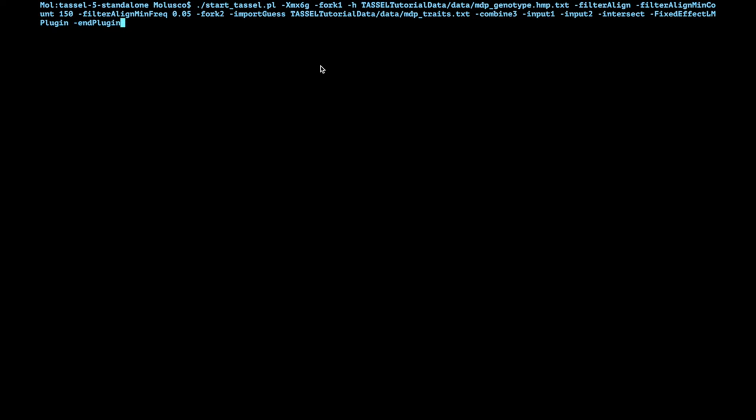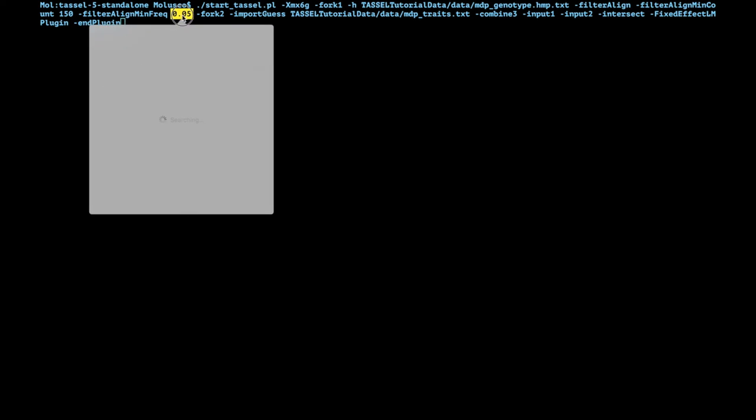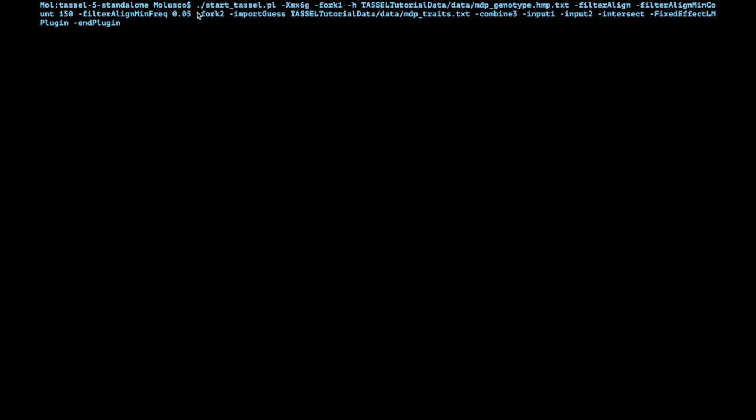Then we're going to say filterAlignment for minor allele frequency. And this, as I mentioned in my GWAS 101 video, is to avoid outliers, things that are very low frequency driving false associations. So we're going to set it to five percent which is this value.